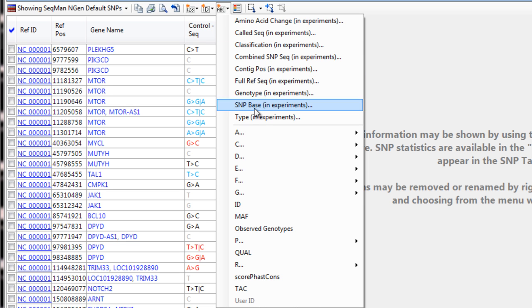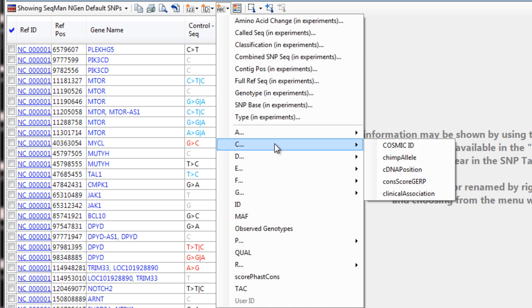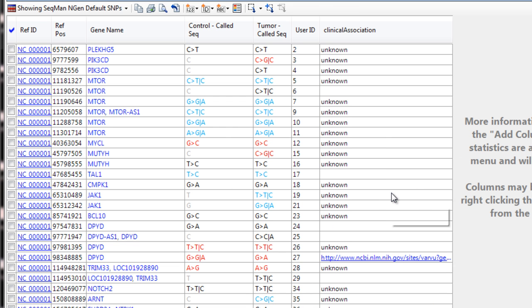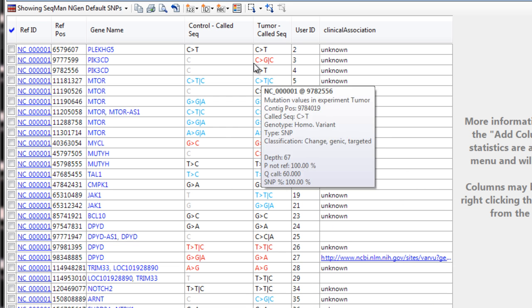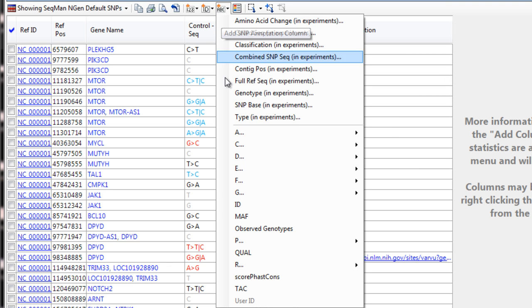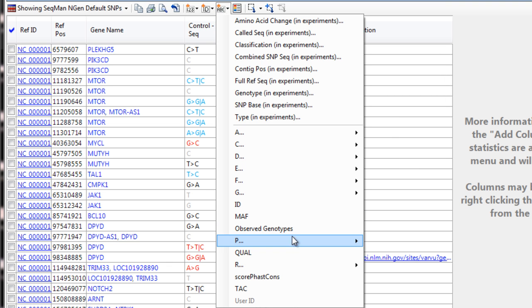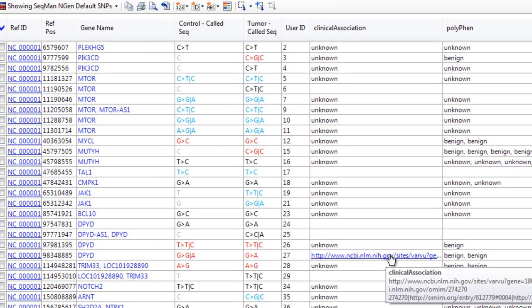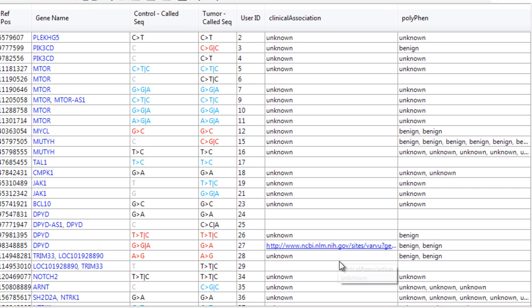For example, we can add the Clinical Association column to see OMIM information, and the Polyphen column to see a prediction of SNP effects on gene function. We can then use these annotation columns for SNP filtering.